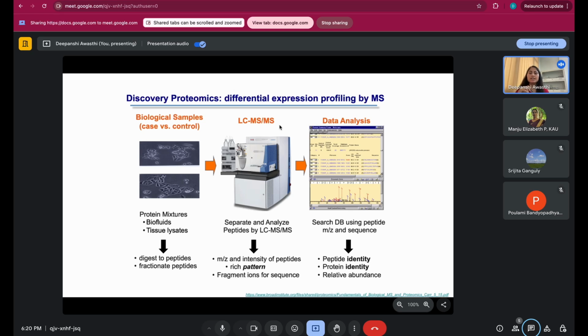In that way it improves the resolution and gives you precise information. Sometimes you have a very large protein, and you are passing those larger peptides through the first ionization chamber. You will not be able to compare them properly, because the ions will be large, and the fragmentations are not that good to study. So we use another mass analyzer to further fragment them.